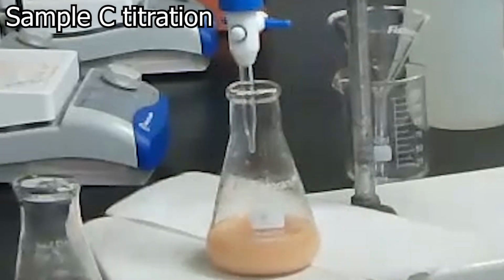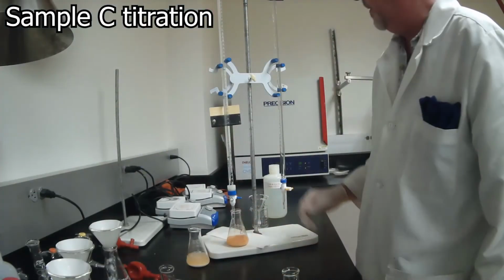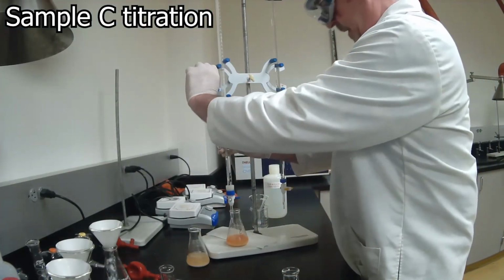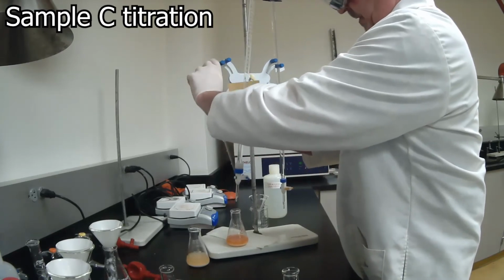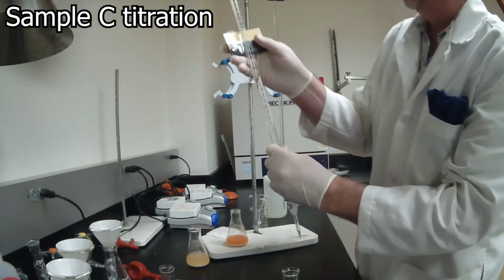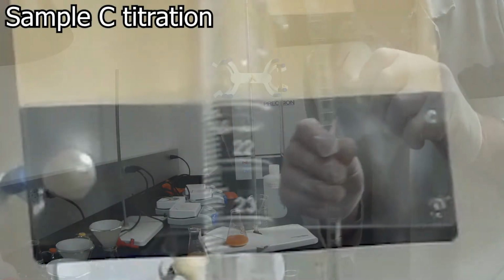All right, so actually sample C has finished its titration. And now we're going to be able to read the volume in the burette. Here we have, again, numbers increasing down.